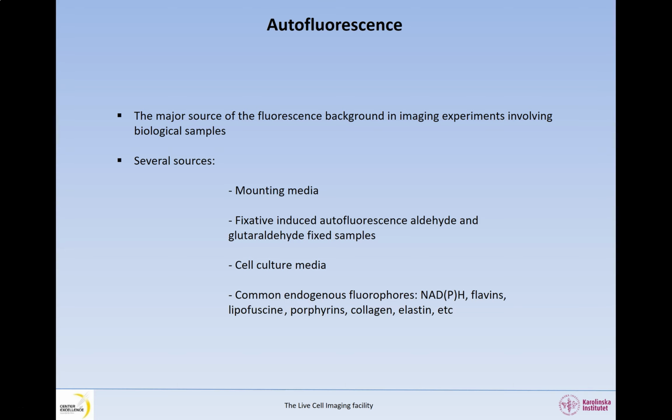The most commonly used fluorophores in immunofluorescence assays are the green channel fluorophores, such as fluorescein and Alexa Fluor 488, and natural tissue components can therefore significantly affect the signal-to-noise ratio when these fluorophores are used.